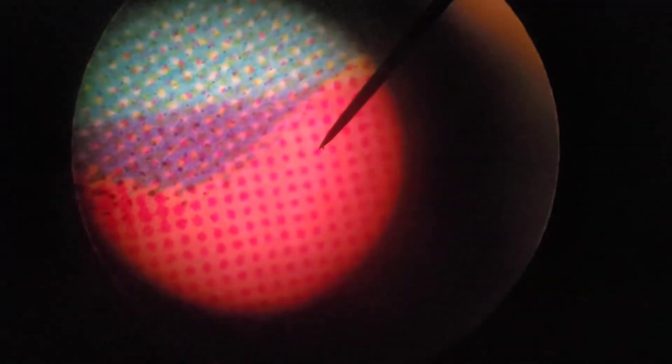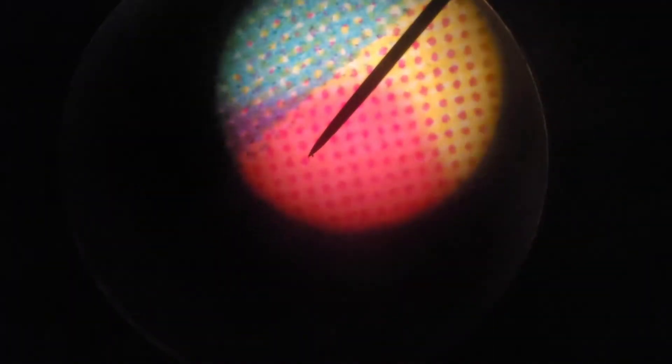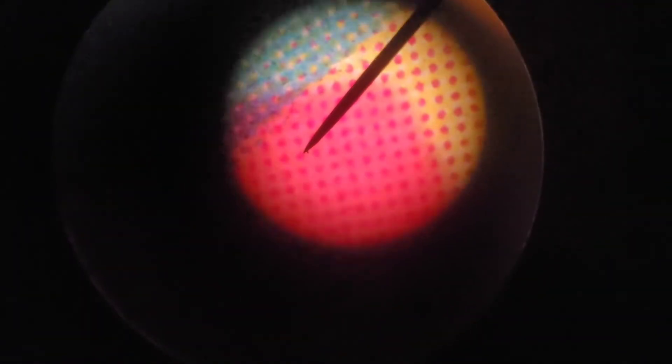So here we have a little piece of magazine under the microscope. You can see all the little dots where they mix the color together. Pretty cool. Oh yeah, again, focus can. So they've got purple, red, yellow, and blue. It's kind of cool how you can see all the dots underneath the microscope.